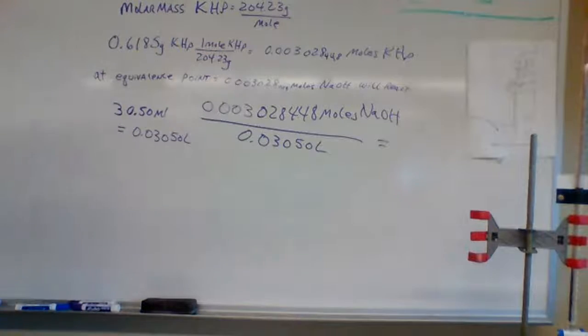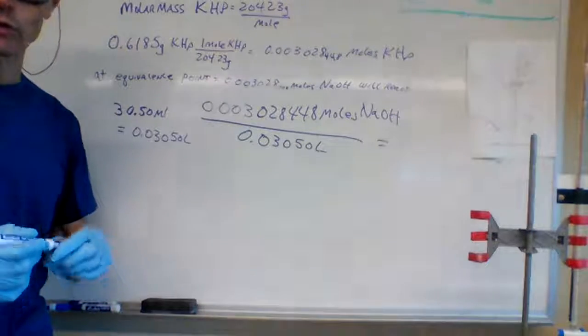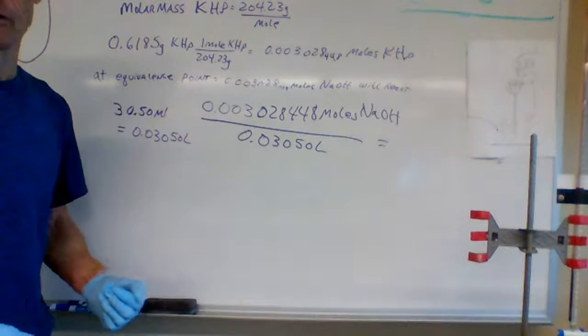Remember, it was approximately 0.1 molar. We find out precisely what its molar concentration is, and we would use that in our experiment.